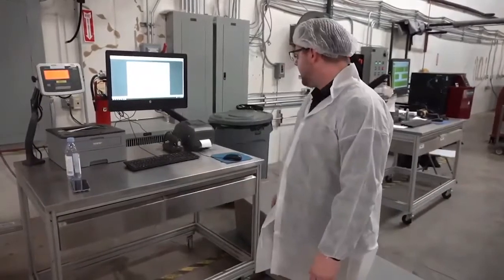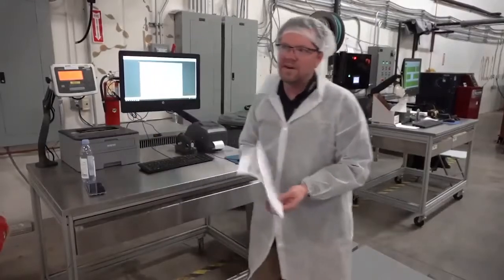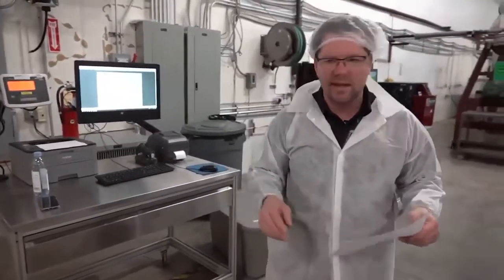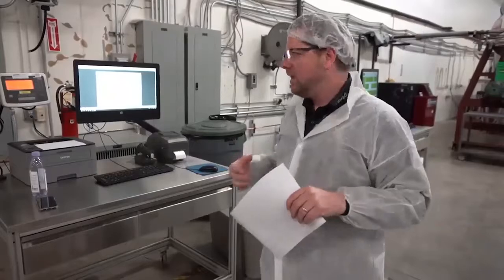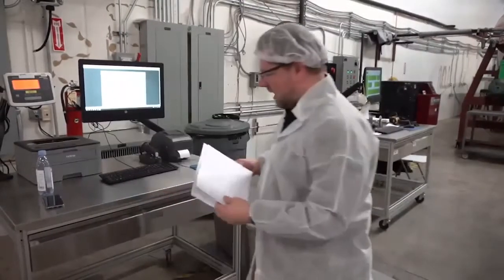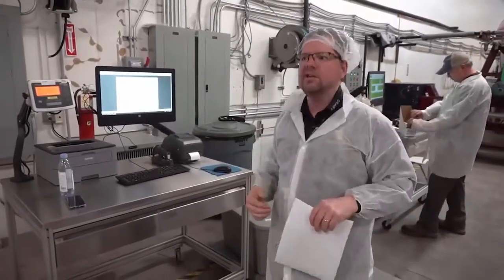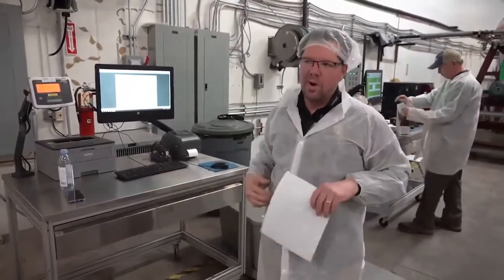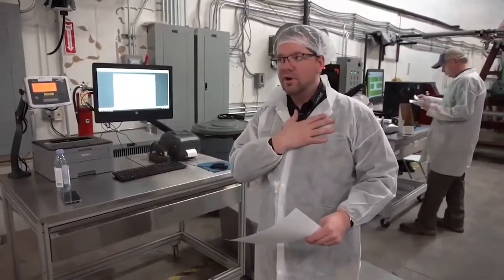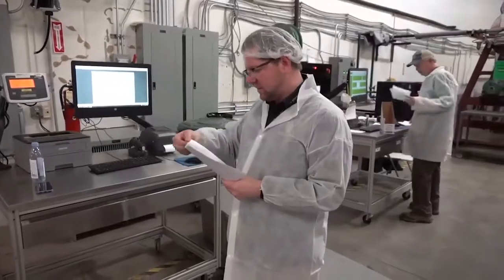So it's pretty nice. Now, this system also works for every process. It's basically the same thing. You got materials in, you test your materials. You got materials in and product out. So you're weighing your materials in, you're weighing your product out, you're weighing your waste out. It basically knows that I did it and that I'm in this lab and in this facility here.